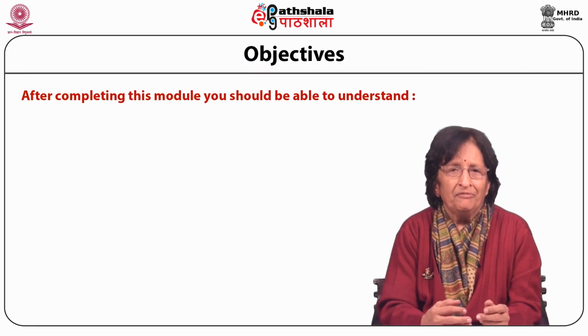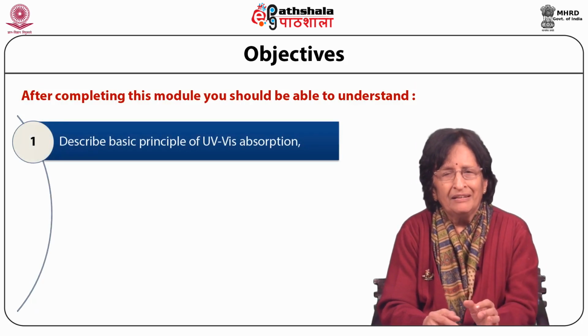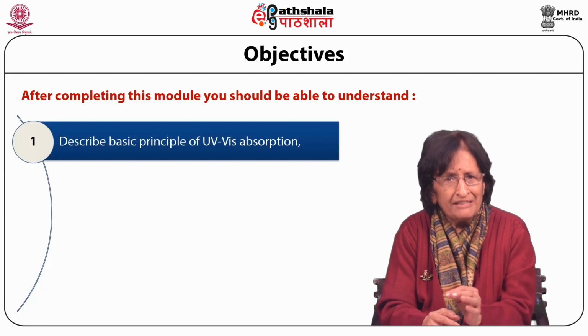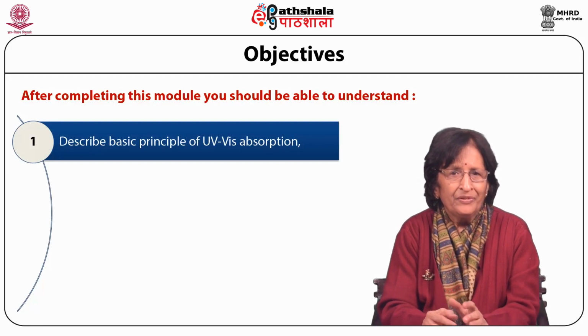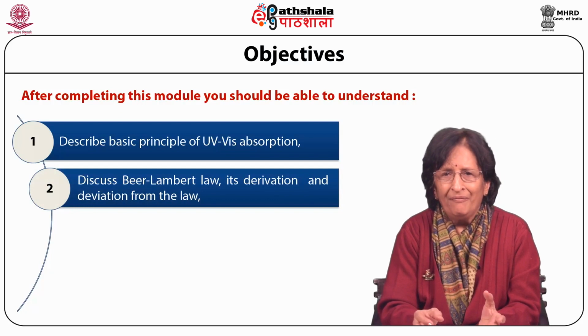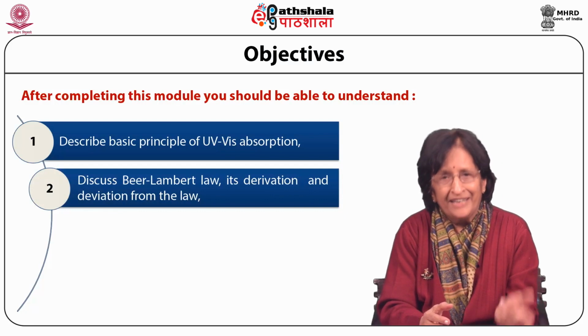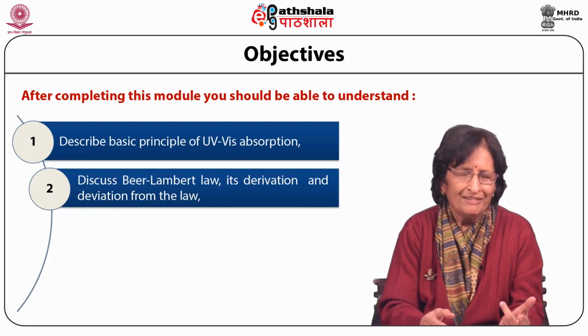We are going to describe the basic principles of UV-Vis absorption. You will know Beer-Lambert Law, derivation of Beer-Lambert Law, and deviation from this law.